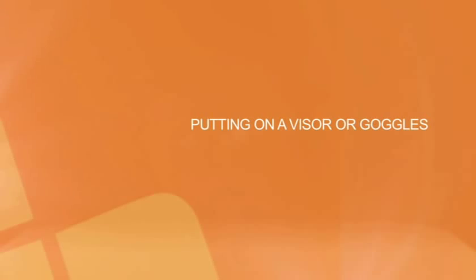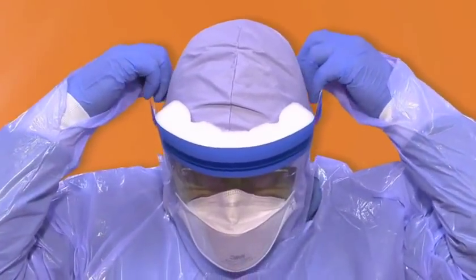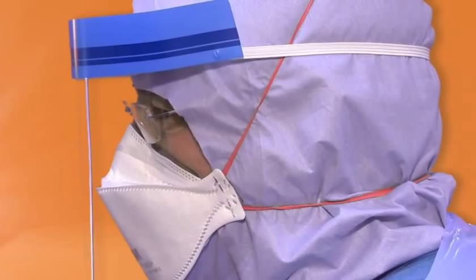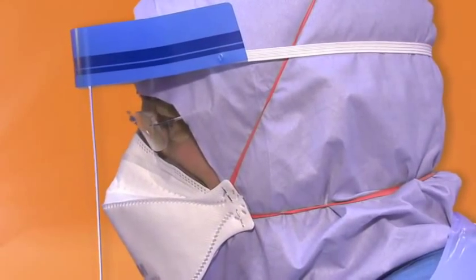Visor or goggles. Place your visor or goggles over your head with the strap at the top. Your buddy should ensure that the visor is in the correct position — past the line of the hood and below the line of the face mask to ensure that no skin is exposed.